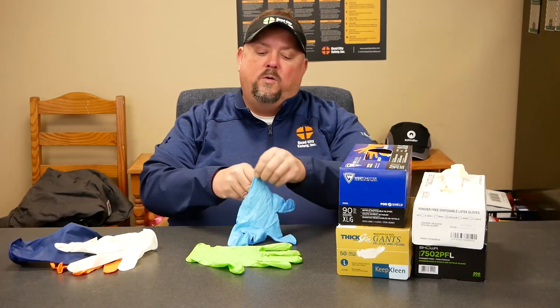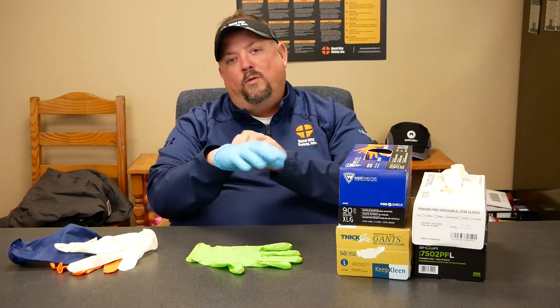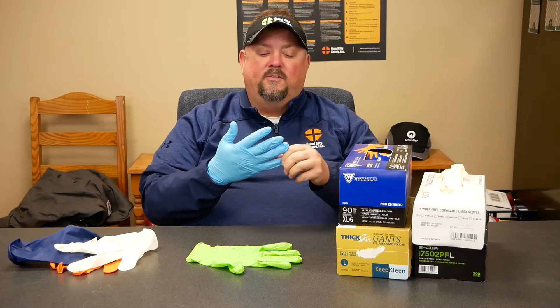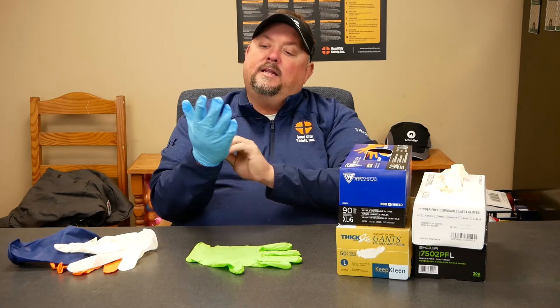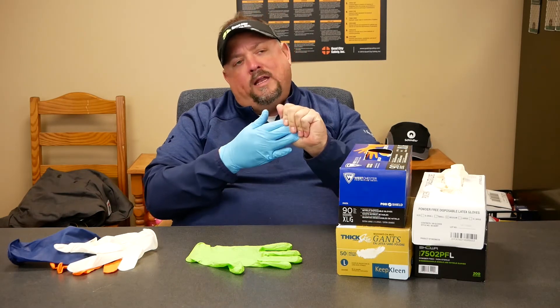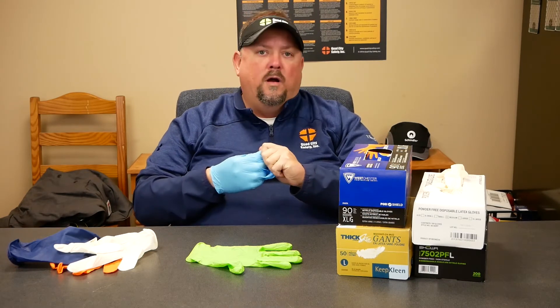When we get into general industry or other safety applications, we start at vinyl, but vinyl really gives you no chemical resistance and a lot of times people don't like it because it's not tight-fitting. When we move towards something that hugs the hand, we work into nitrile. Nitrile gives us some potential chemical resistance and a tighter fit, and we can utilize it in medical situations where we need that Class 1 medical device rating.